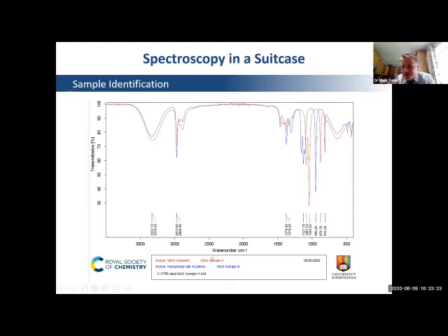Now, sample H is also an alcohol. And so when we look at this part of the spectrum, you can see the OH peaks and the CH pretty much overlap because they're both OH functional groups. But when we look at the fingerprint region, we can see, yes, we have got completely different peak positions. That has changed. Now, these alcohols are very similar in structure. There's only a CH2 difference between them, but that's enough to give a very different fingerprint region, and that shows, again, backs up with the vibrational modes and also the database, how you can differentiate very similar molecules.